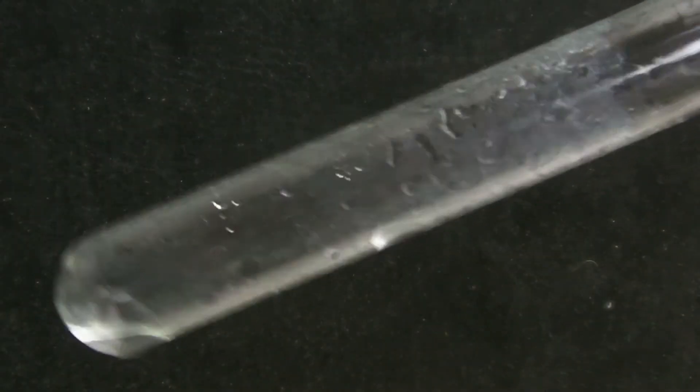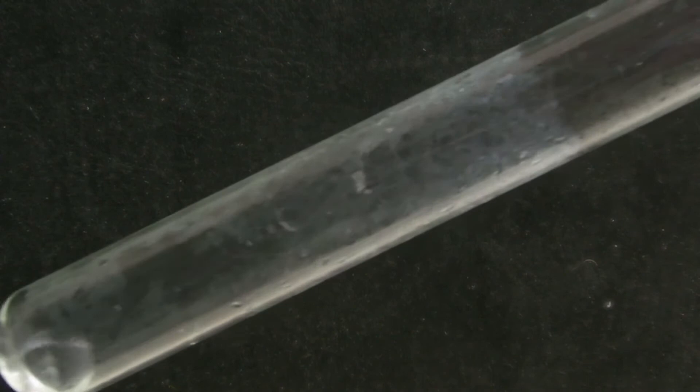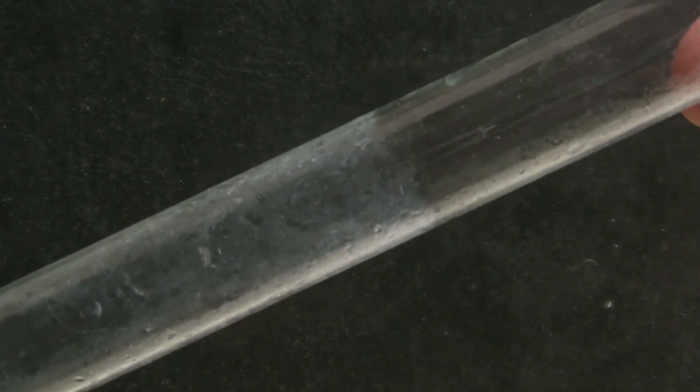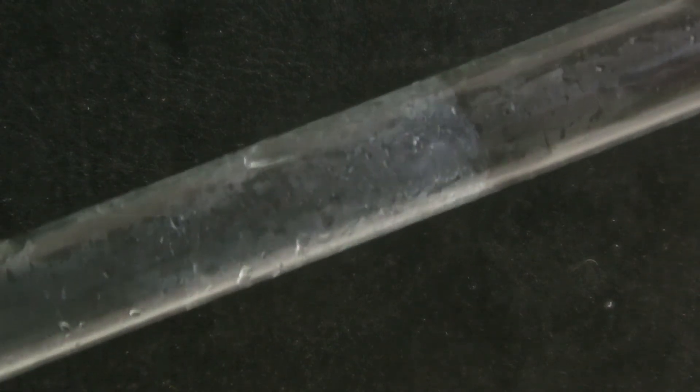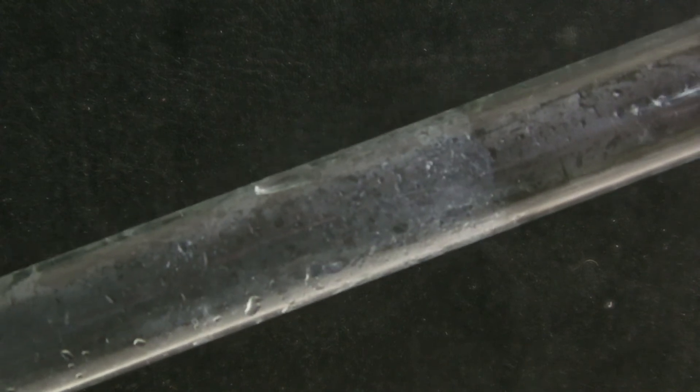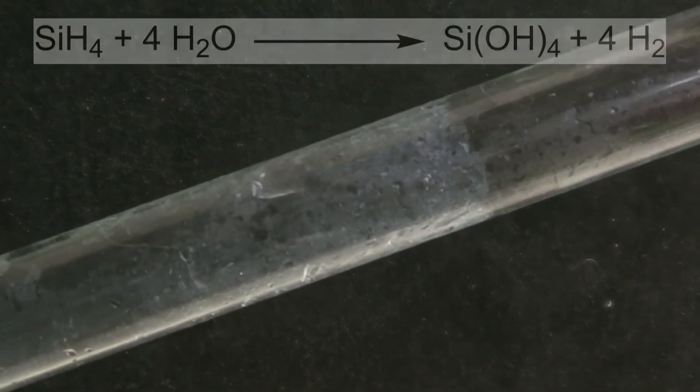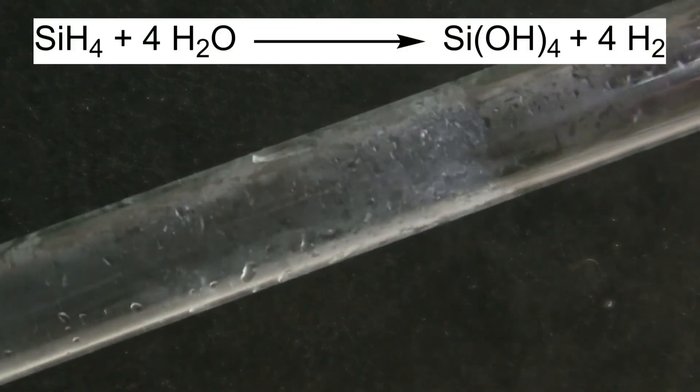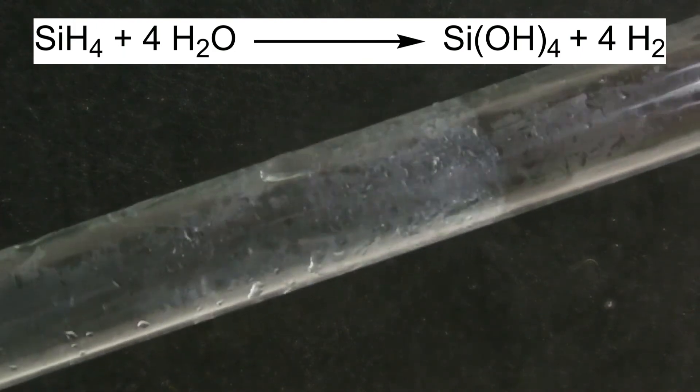The test tube had a white residue on the inside which can be explained in two ways. One possibility is that the dissolved oxygen in the water did react with the monosilane gas. The second one would be that the silane had reacted with the water itself to form silicylic acid.